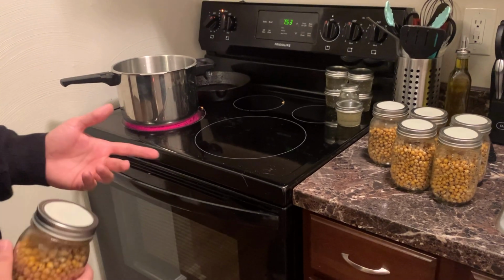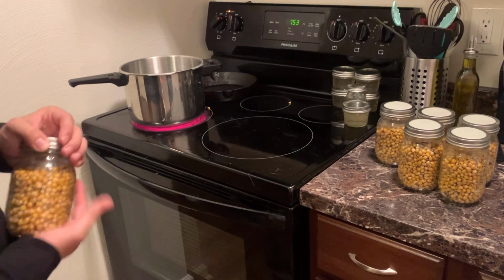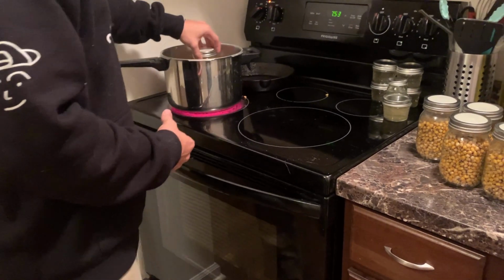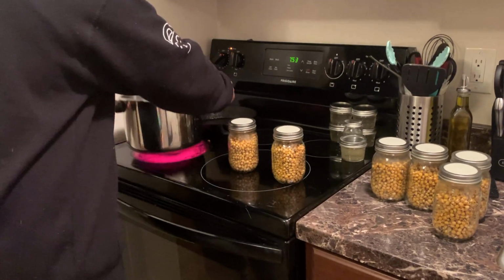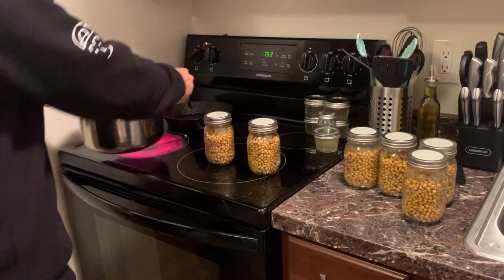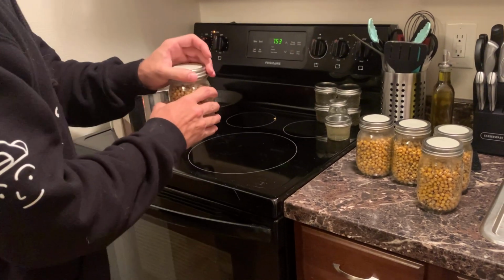This probably is gonna take you a few times if you're new at it. I probably contaminated 5 or 6 batches before I figured out how to actually work my pressure cooker and get it right. So we're just gonna throw it in there. You don't have to let the water boil or anything, but I'll show you guys. Add a few inches of water in there just so you don't run out in your 90 minutes of pressure cooking. So when you throw them in there, you just wanna give your lids a half turn open and then throw them in there. I'm gonna do 3 at a time.